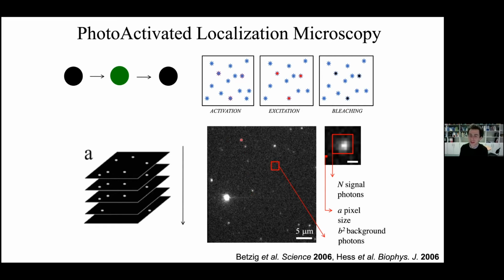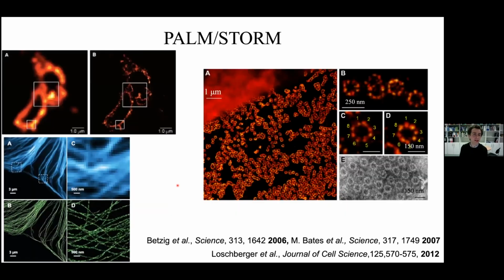And then for each set of molecules that you have in your image, you can localize them precisely. And so you store on the side the position of each molecule. And then in the end, you sum them all up. And the result of summing them all up leads you to a substantial increase in resolution, because now you are basically plotting just the centers of all your molecules. You got rid of this diffraction-limited image, which was overlapping from each of the molecules.